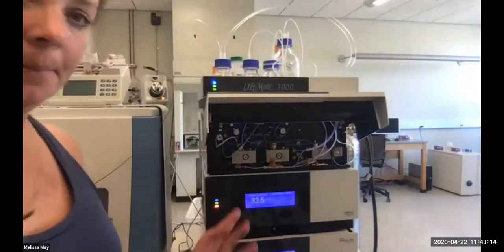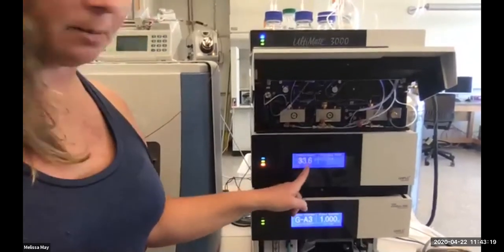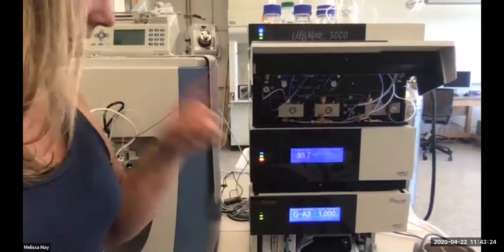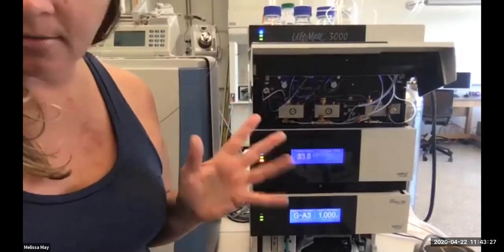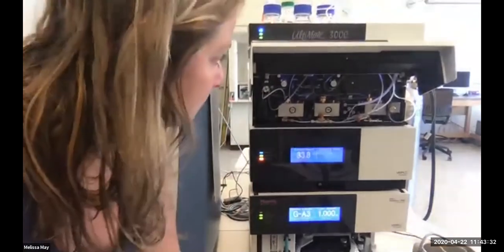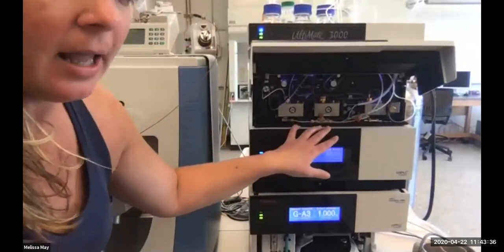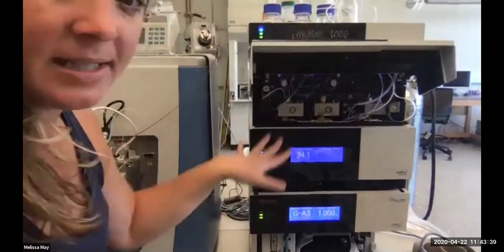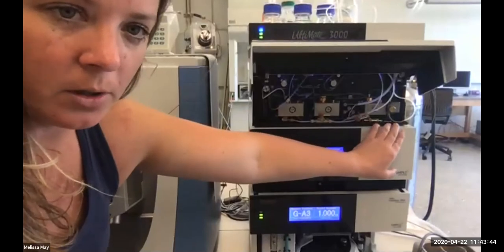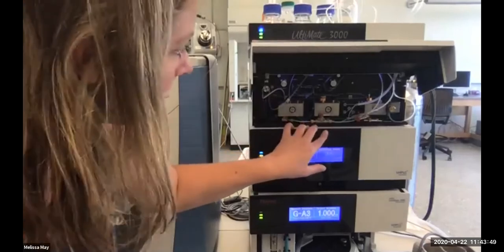So you can see that because I had the column oven open, I know it's kind of blurry, the temperature dropped to 33.6 and this status light turned orange. That just means that it will run, but it's not completely set the way that you wanted it to be. At the top here is where we have our valve settings. And so all of these lines are coming down and being plumbed into these different pumps. Over here is where we have our loading pump, and these are our two nano pumps. So we have our right block and our left block.